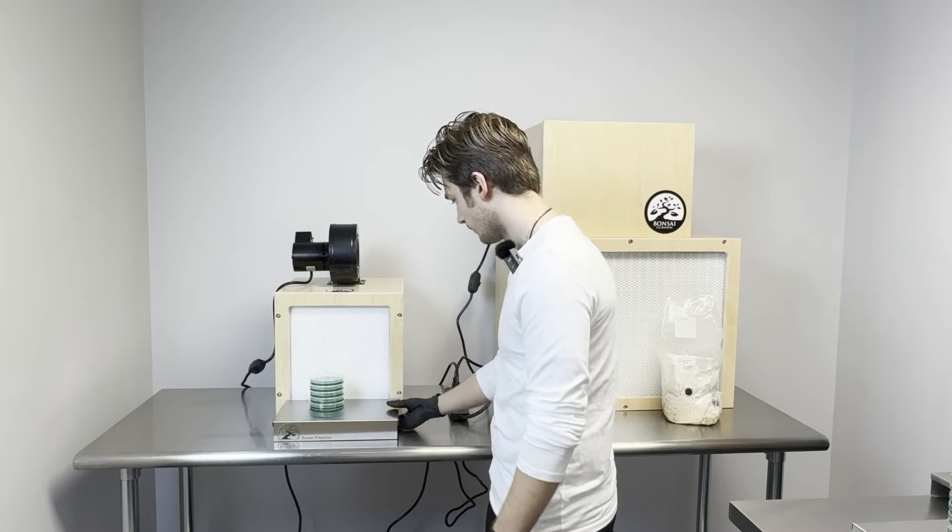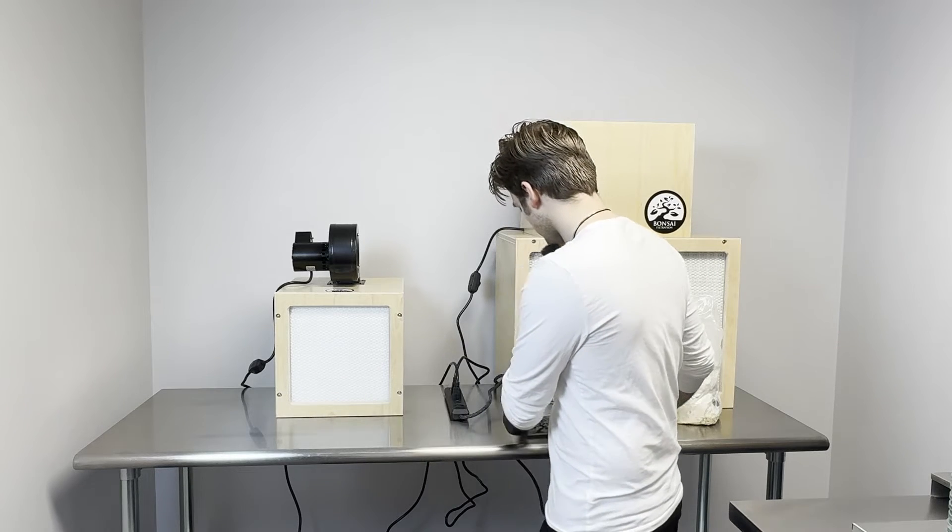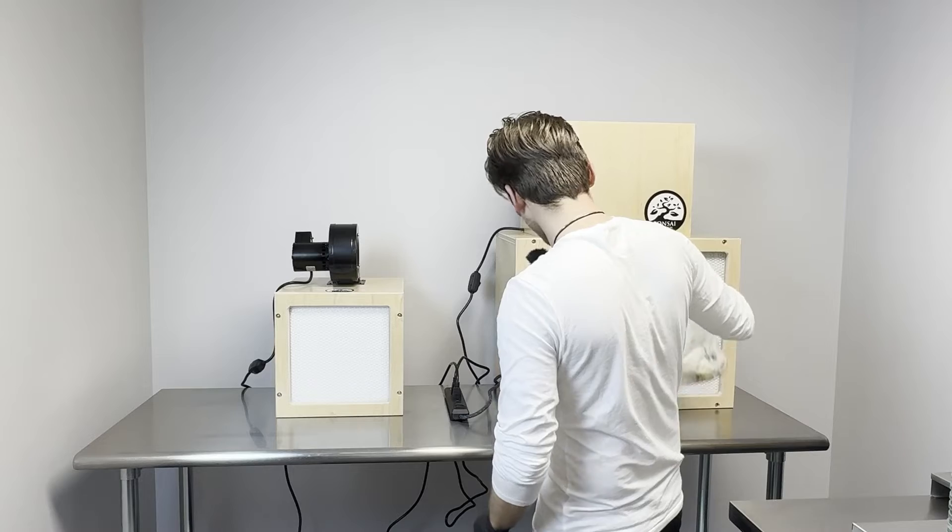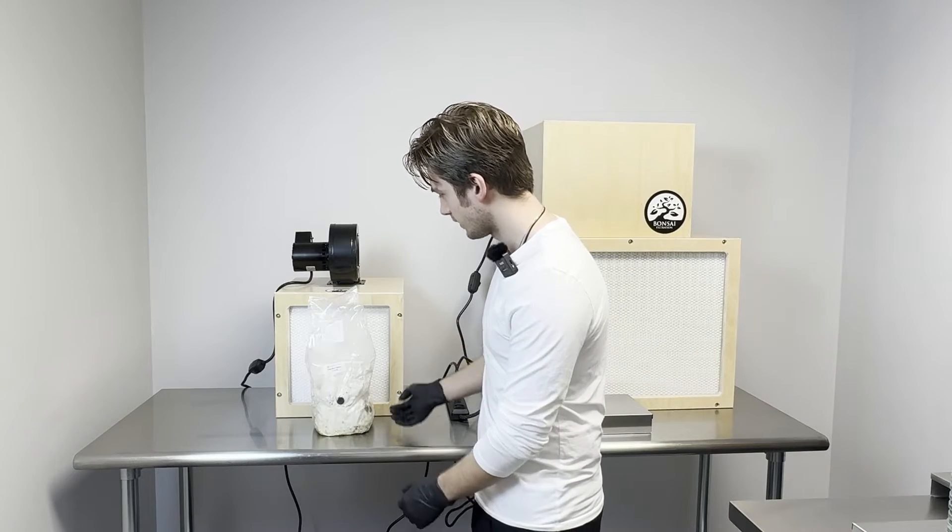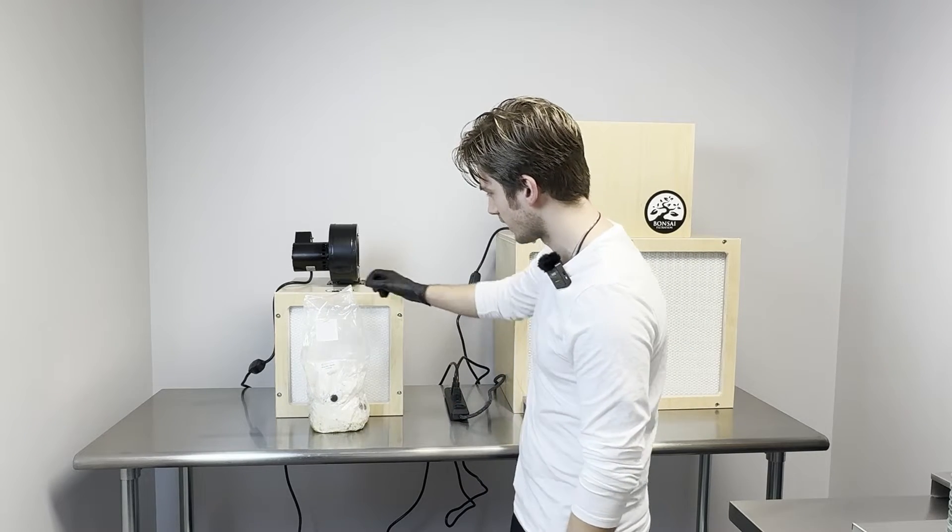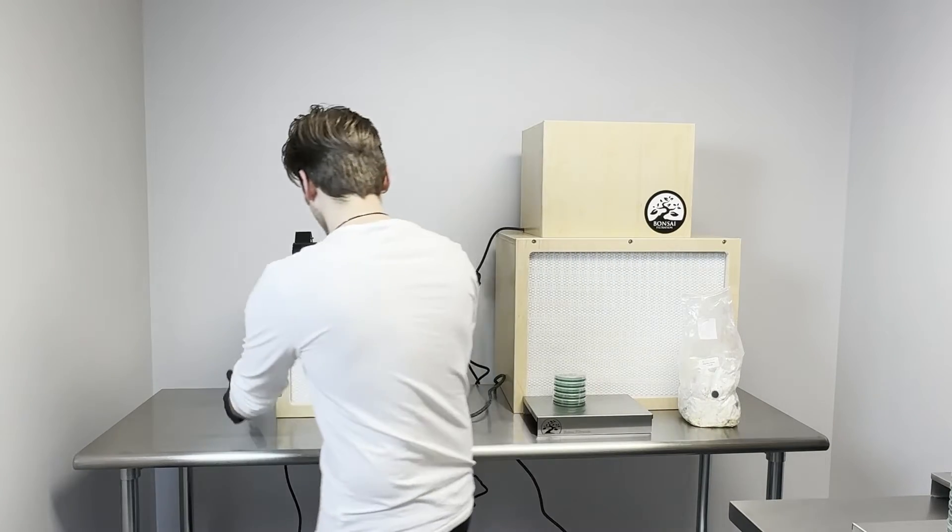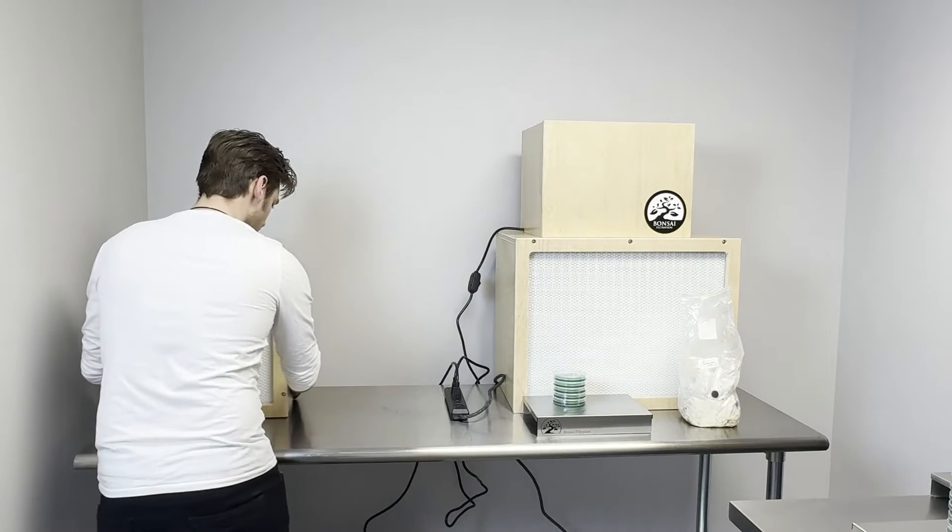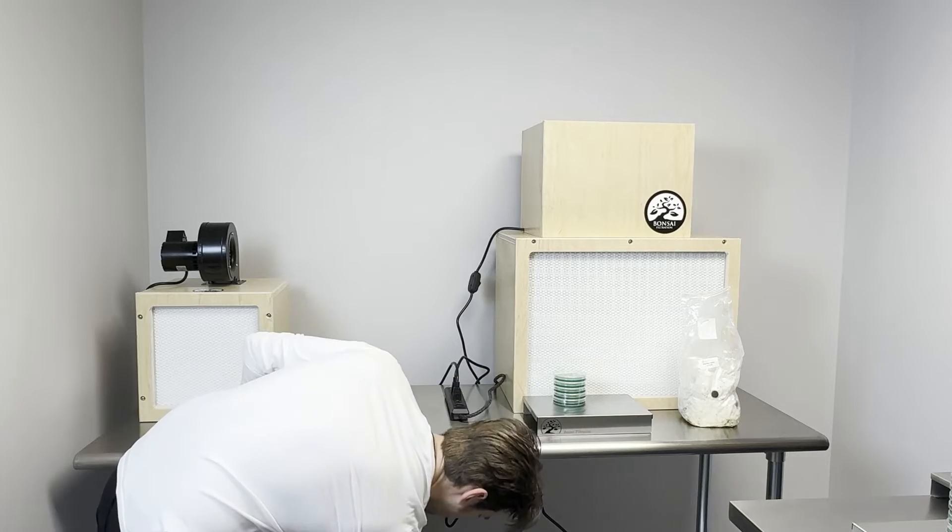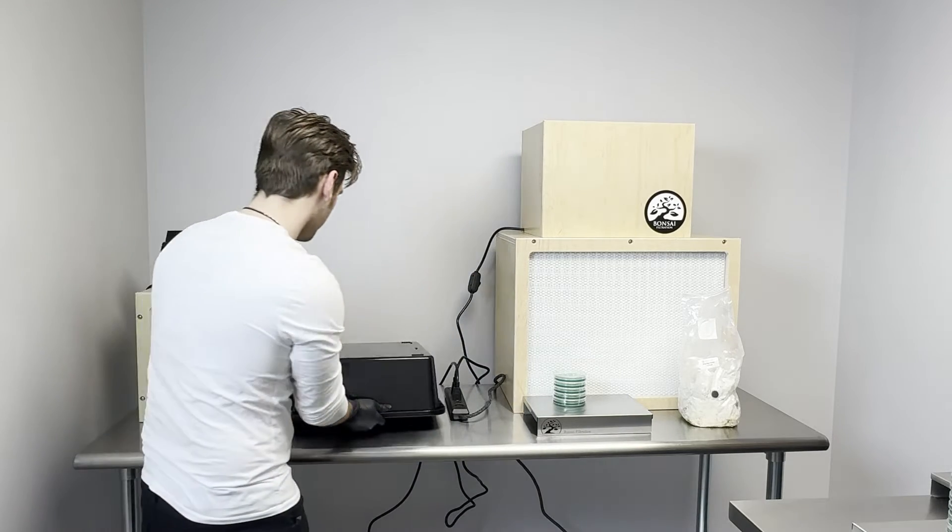You could also use spawn bags as well, but as you can see it doesn't necessarily actually stay within that flow. So what you'll actually have to do if you do want to use spawn bags with your HEPA flow 12, you'll want to get like the bottom of a mono tub or anything else that you can use to raise it up.